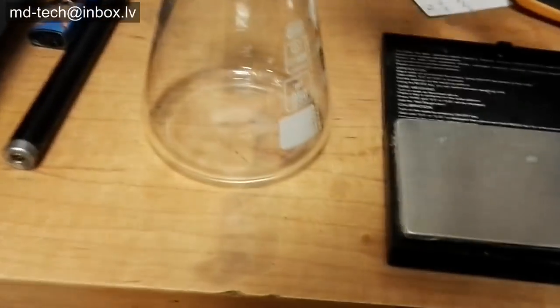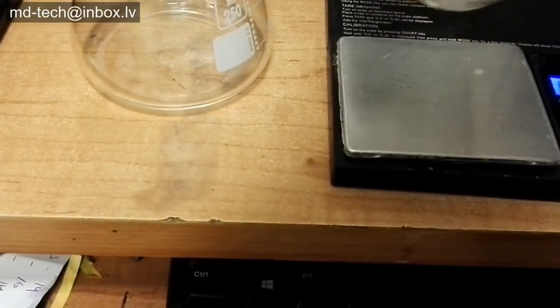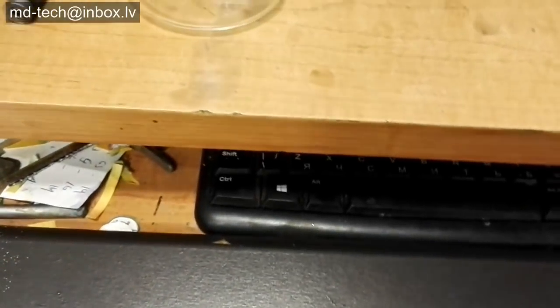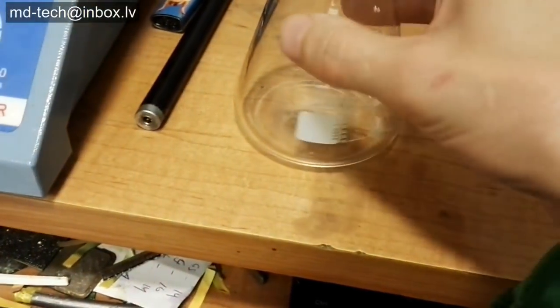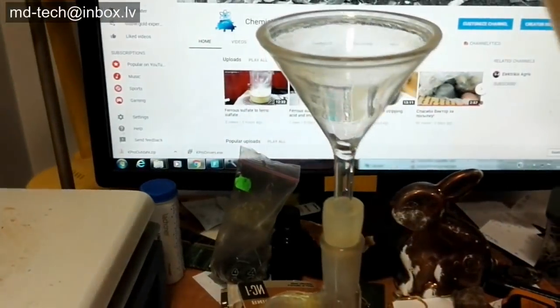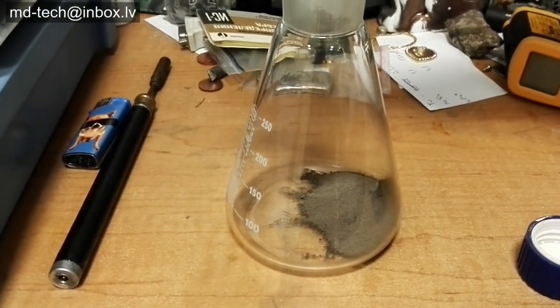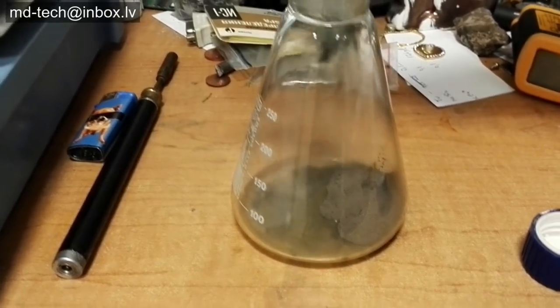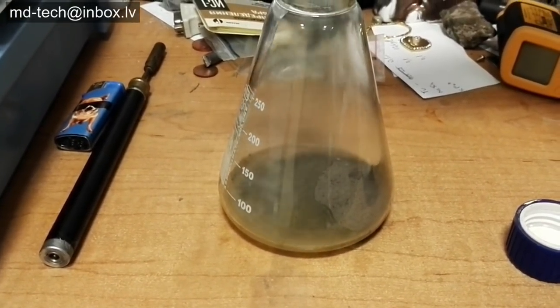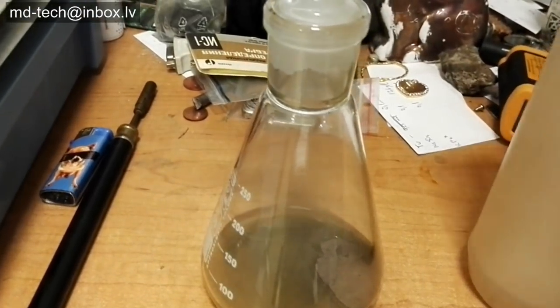I use a small amount of powder to analyze the content. I use concentrated acids with no water added. Add aqua regia to the beaker and heat up to 80 degrees Celsius. Reaction time is about 30 minutes.